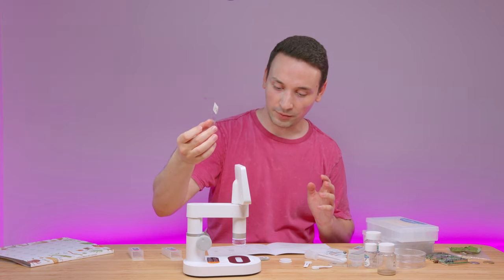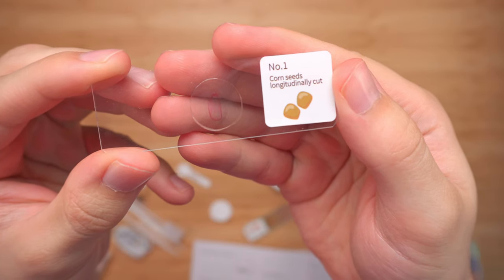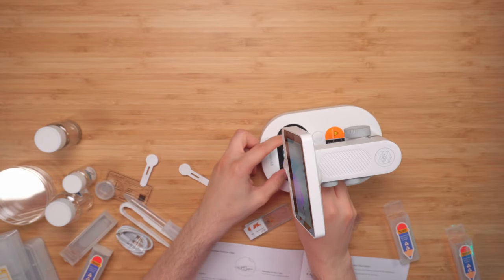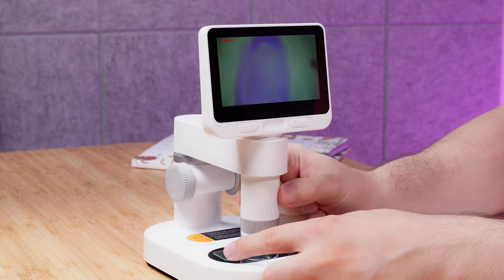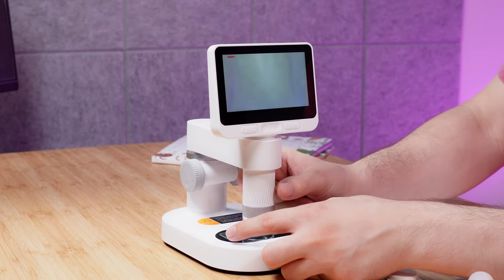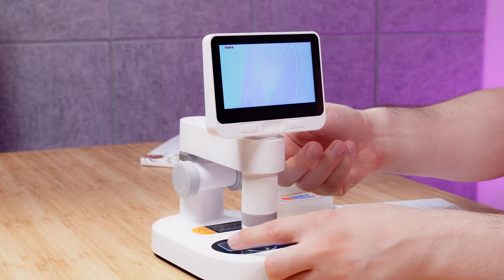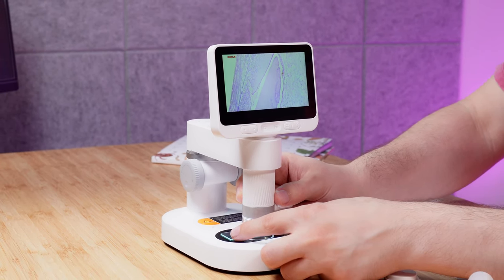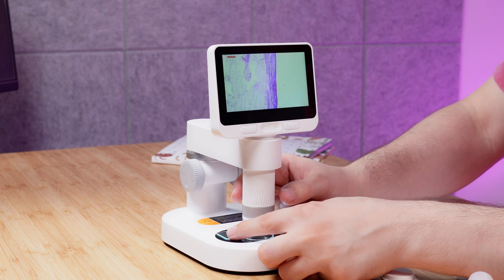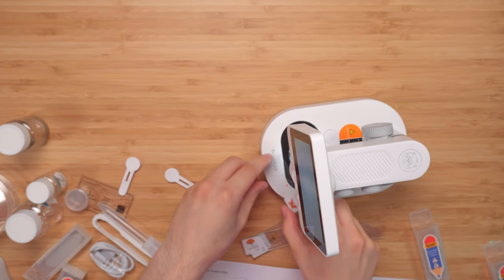Now we're going to look at all the specimens — a total of ten. Here's the first one: a corn seed. I'll put it under and go ahead and record, so you'll see the footage straight from the microscope. Focusing is very straightforward and we can get very close. With the base light on bright white, we can see some nice detail. Next up are the goldfish scales.